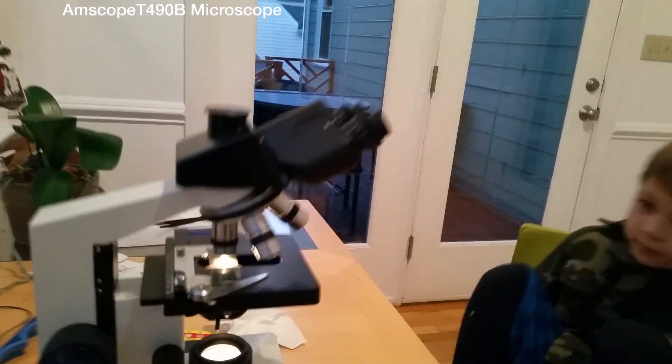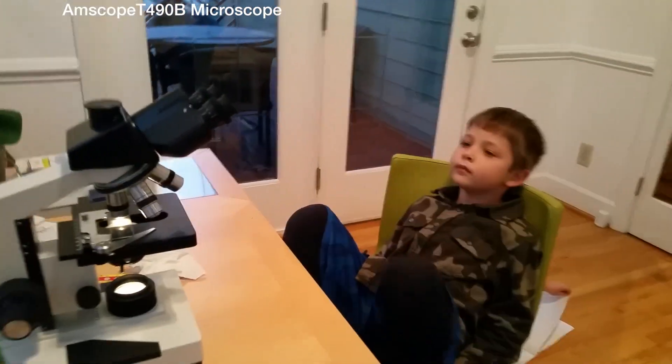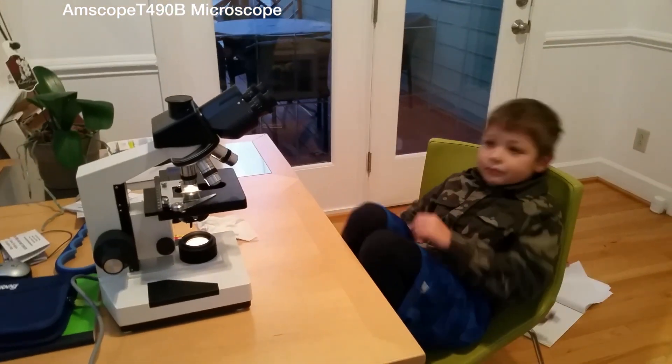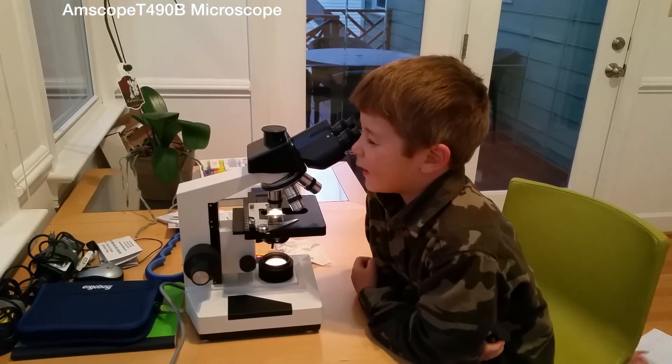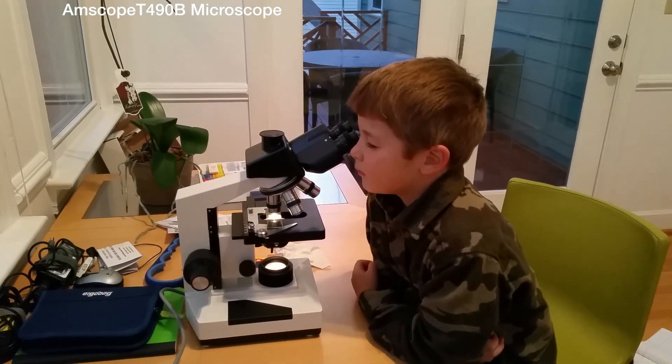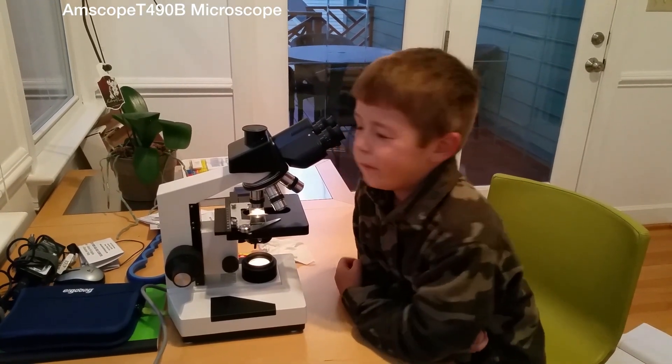We are at 200 magnification here. Take a look, Mr. Lars. Tell me what it looks like. It looks like dots connected, and make logs of the dots.